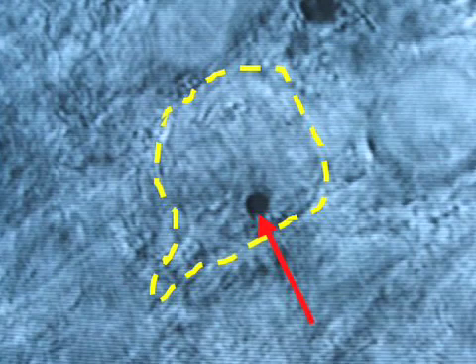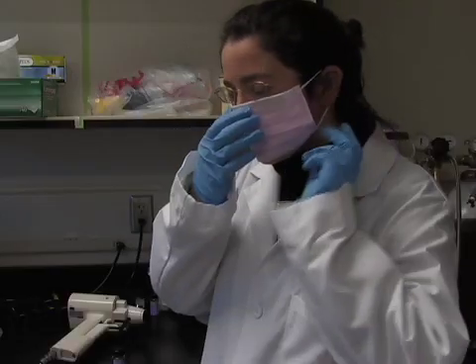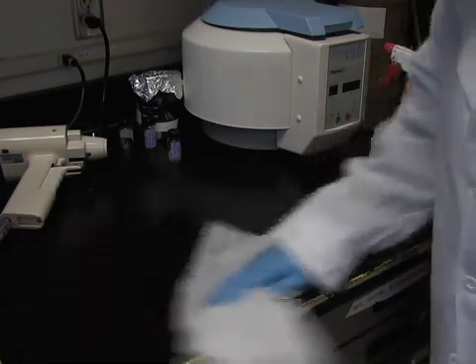In general, when a gold particle ends up embedded in the cell's nucleus, then that cell will become transfected. Since I am transfecting cultured slices, I employ a relatively sterile technique throughout biolistic transfection in order to avoid contamination.